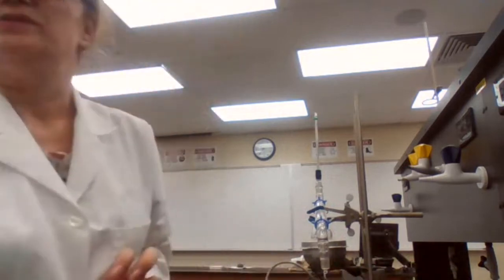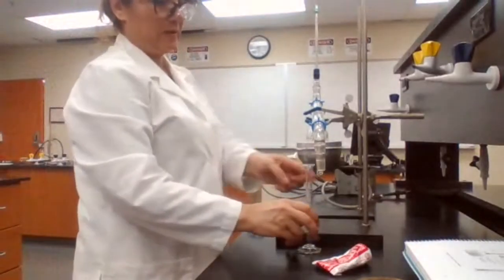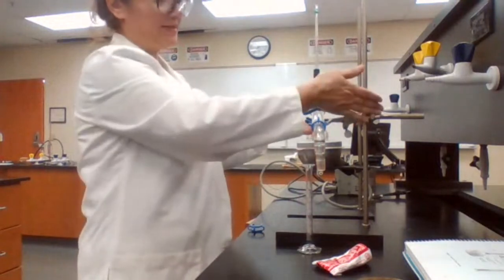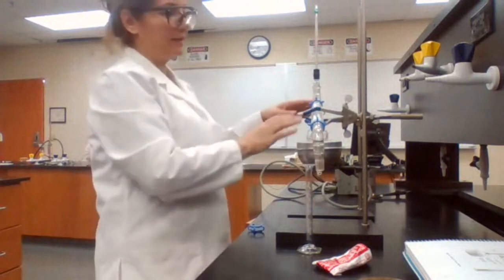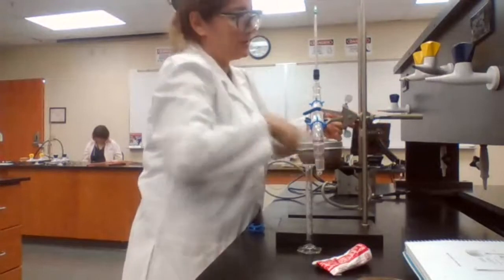We are going to use a graduated cylinder to collect. You see the height now is too low, so I cannot move one piece of the glass only to bring it up because everything is connected. So I have to make all the clamps loose.